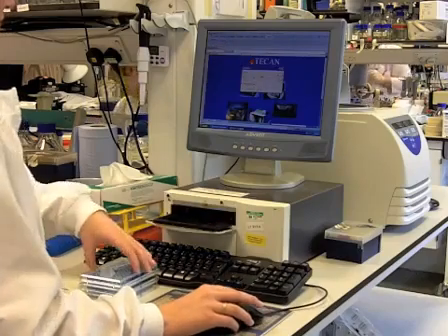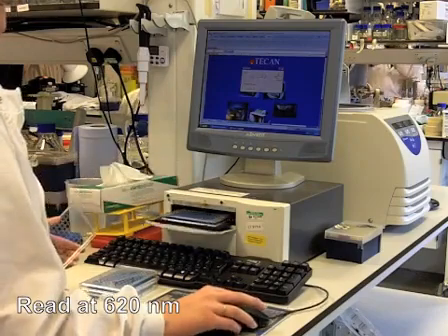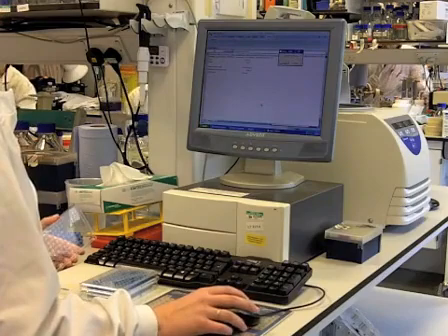To determine the amount of reducing sugars released, the optical plates are read at 620 nanometers. The results that are obtained are analyzed to quantify the released sugars as nanomoles per milligram per hour of reaction.